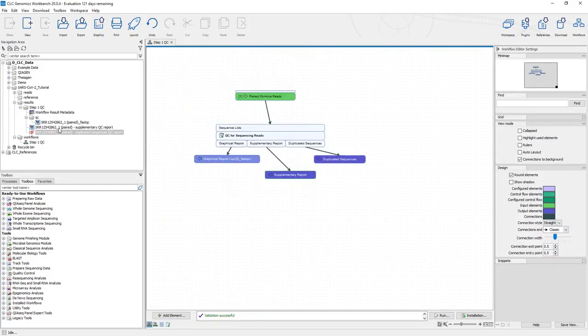They aren't important for the analysis that we're doing here. And with just about every analysis that's performed, you get a workflow and metadata results table, and we'll discuss these metadata tables in a much later session when we're trying to keep track of lots of data.